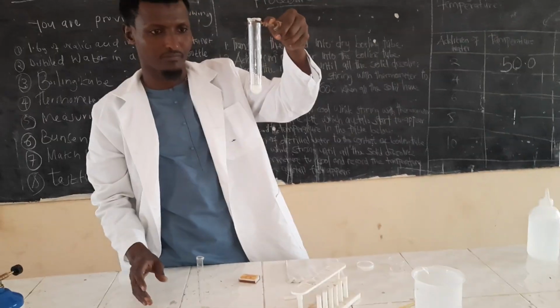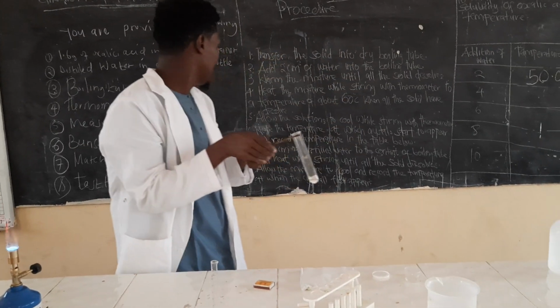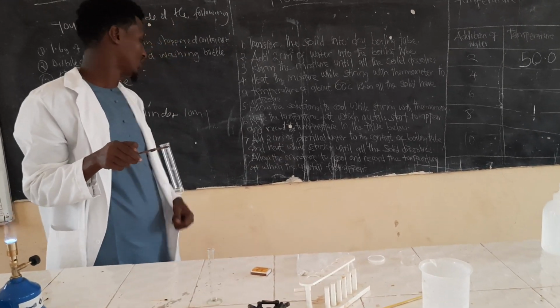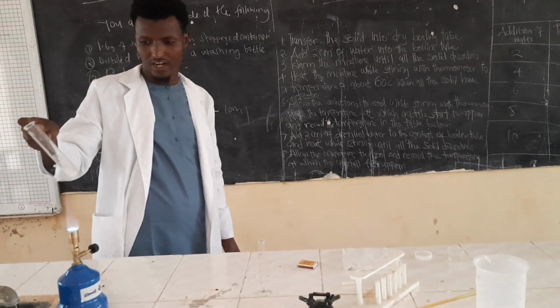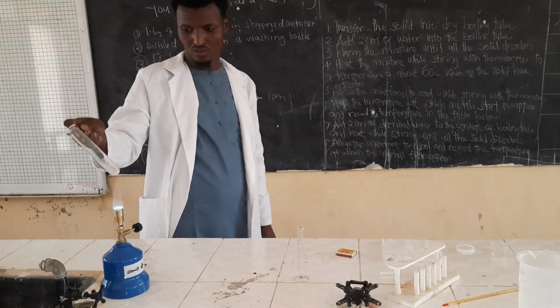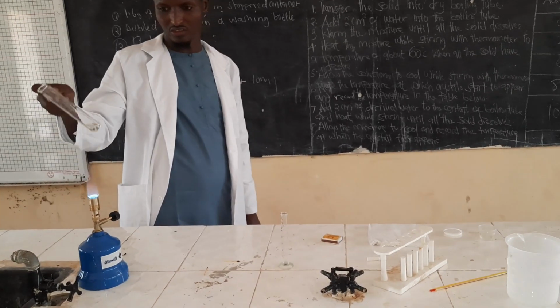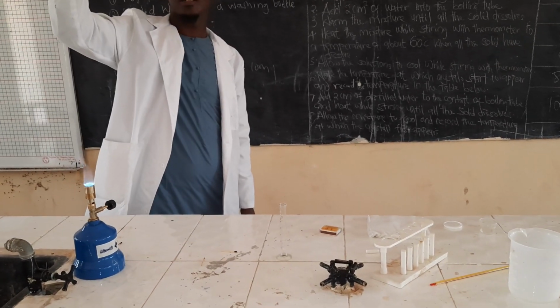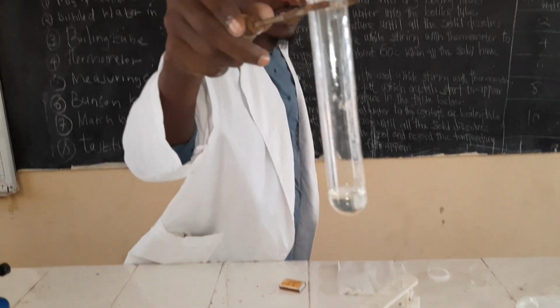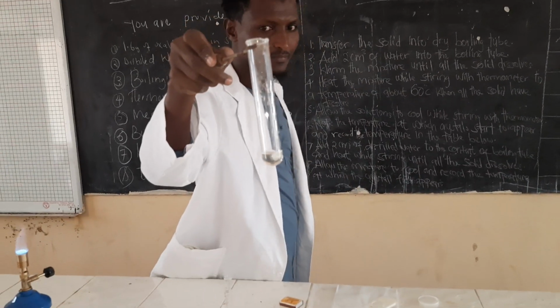I've added. Now they are saying heat again while stirring until all the solid dissolves. Heat so that all the solid dissolves. Do you see now? All the solid has dissolved. Good.